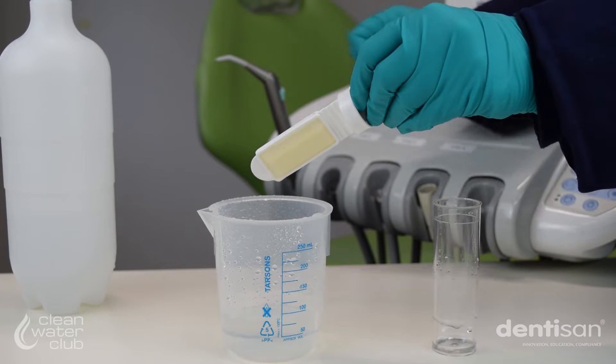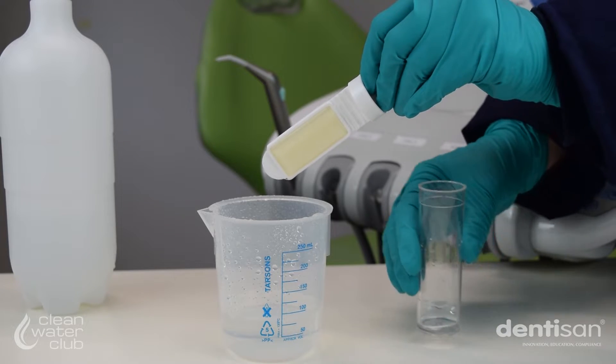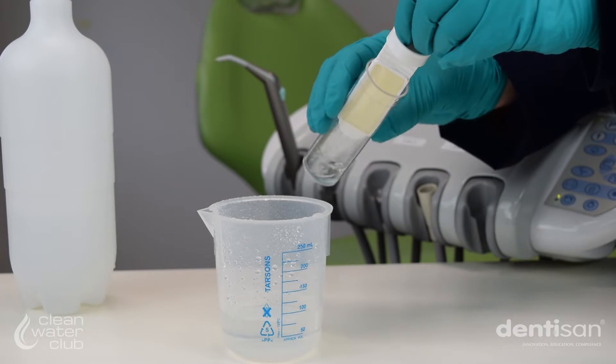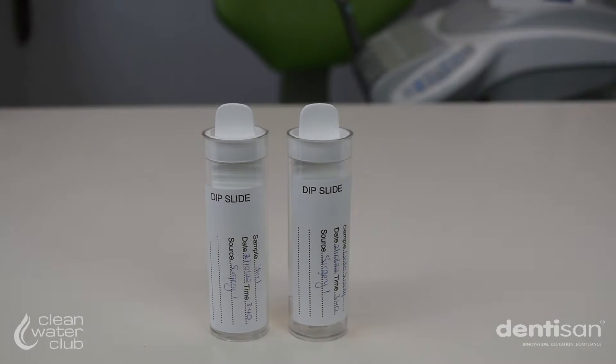For each dip slide, allow any excess liquid to drain for one to two seconds, then replace the paddle and cap in the tube, ensuring it is pushed fully into the tube. Immediately incubate the dip slides, either at 30 to 35 degrees for 48 hours or at room temperature for 72 hours.